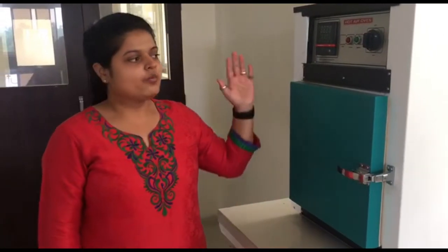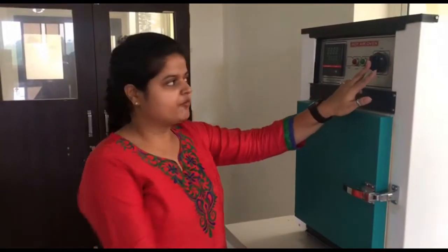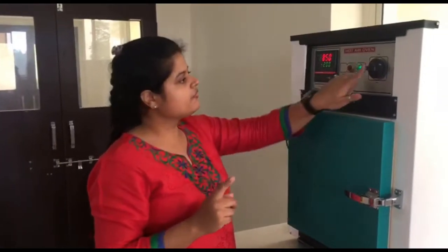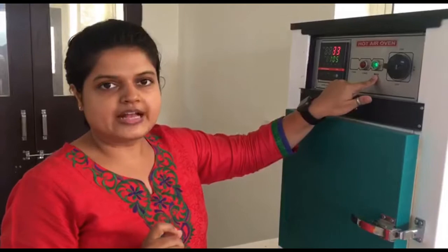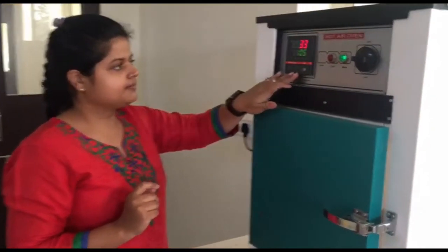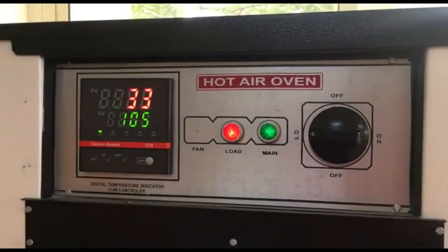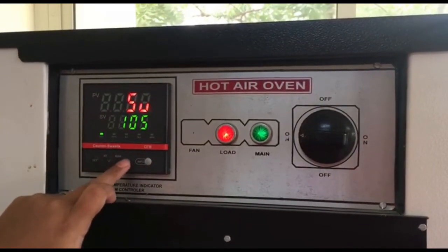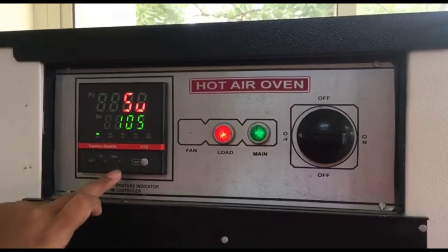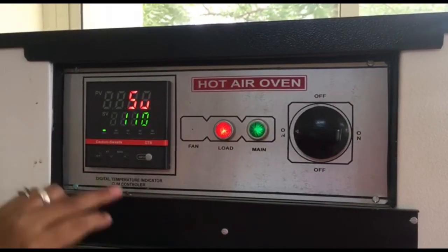Now let us see the construction of hot air oven. When you look at the instrument you will find that it has a switch on and off button. When you switch it on you will find a green light glows, which indicates that the instrument has been switched on. Over here you will find a digital temperature controller. You can set your desired temperature by pressing the set button and you can use up and down buttons to set your temperature — say if you want to set it at 110 degrees.